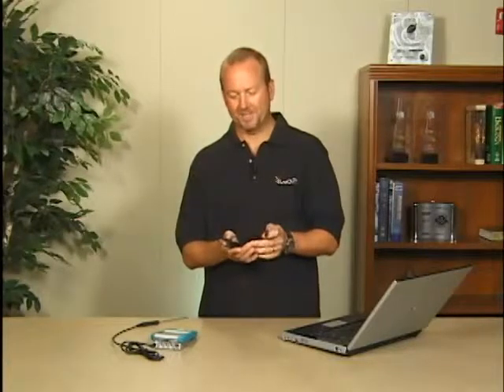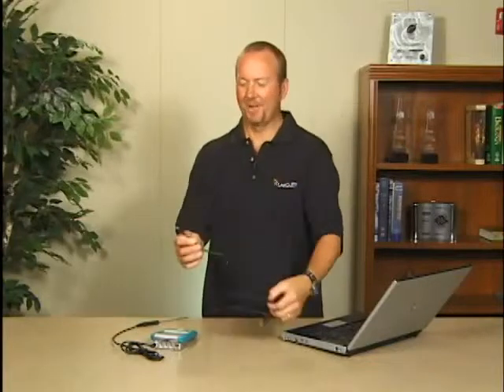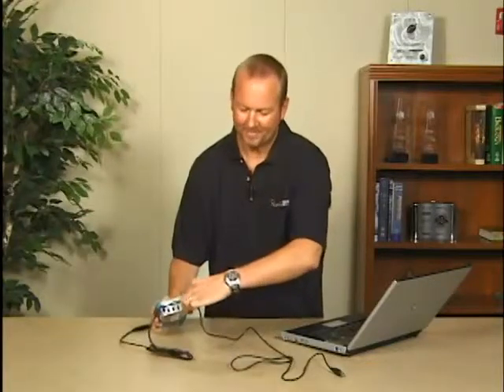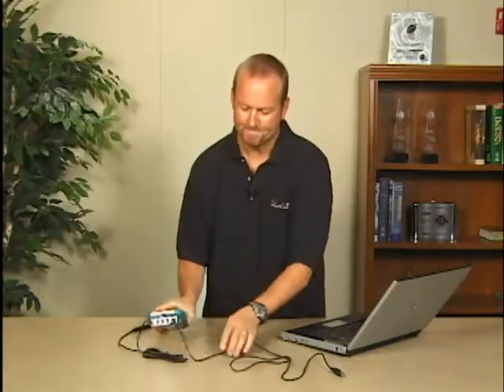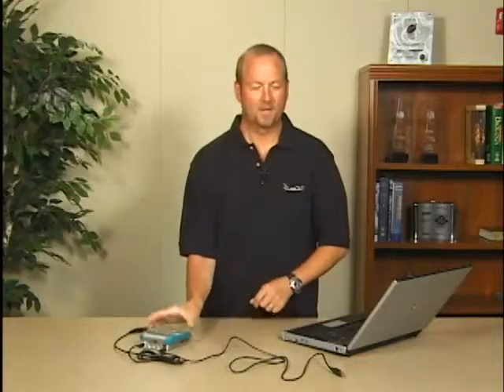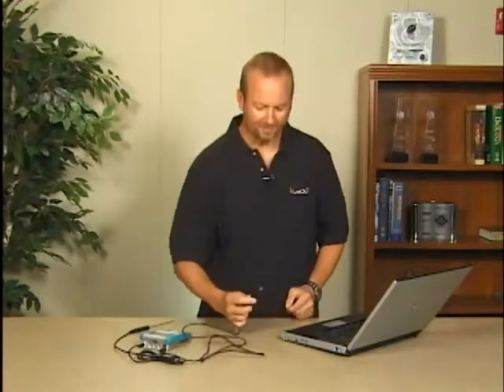Now we take the cable that was in the box with LabQuest. The cable has two ends, a big end and a small end. The small connector goes to the LabQuest, right down there. Then we'll plug this into the USB port on your computer.